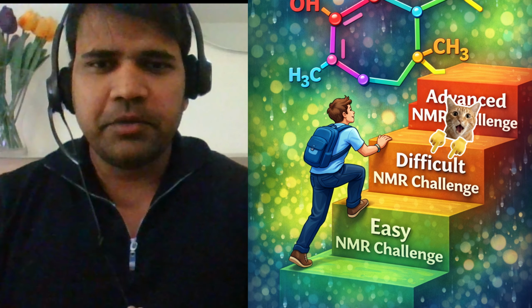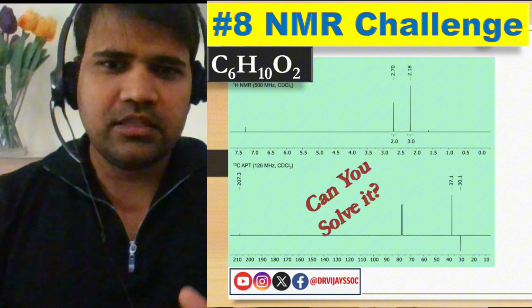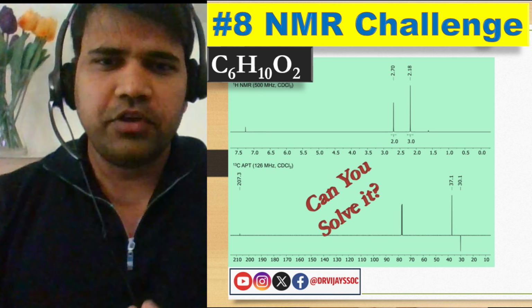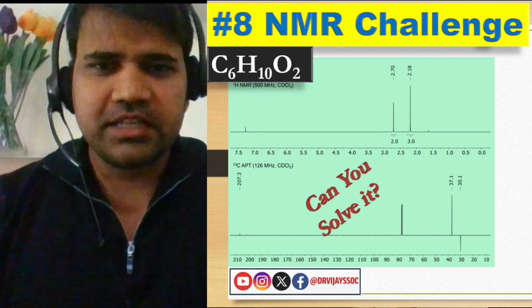In the previous video, I provided this NMR challenge for you. And today, we are going to explain the solution step by step. If you have already solved it, then you can match your answer by the end of this video. So let's start today's NMR challenge.